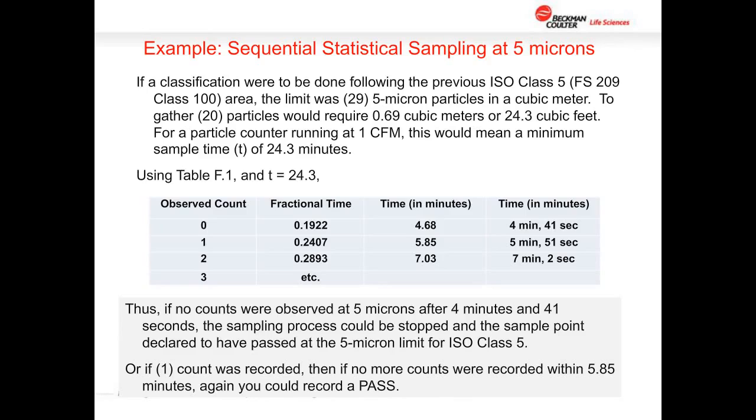So again, this is based on the assumption that the air is consistent at that point during the time of sampling, and that as you sample more and more in time, you'll still be getting the same result, and you can predict ahead of time how it will be, that you'll pass or you'll fail.